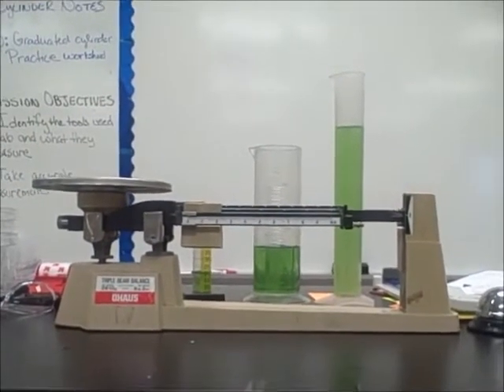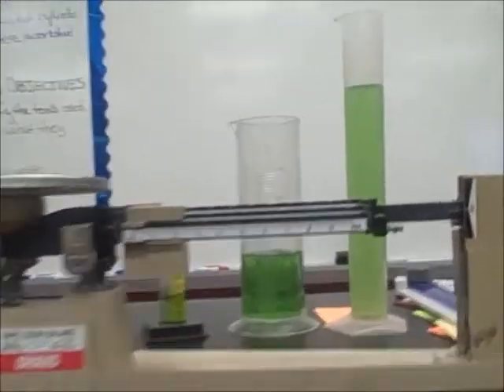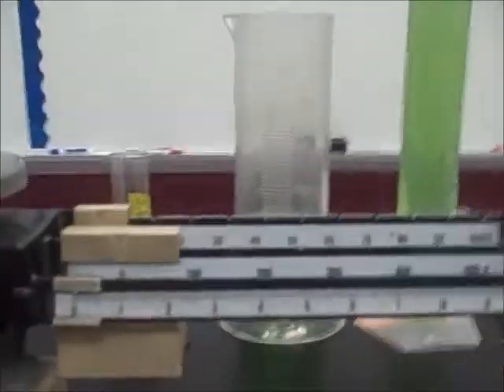This is a triple beam balance, and it's called a triple beam balance because, if we zoom in here, it has three beams.